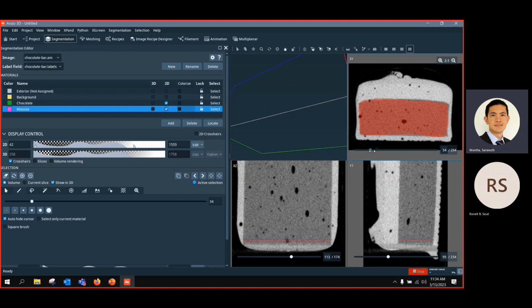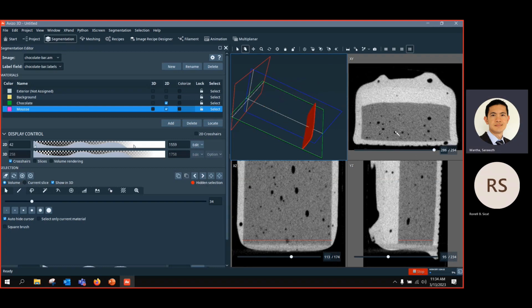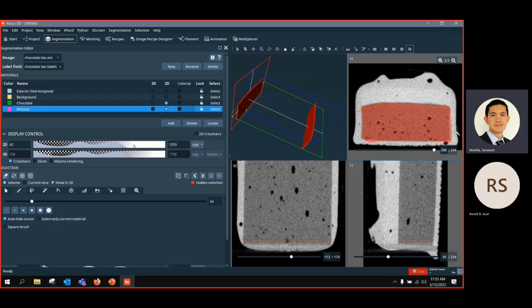Yeah, and then you can look here on the 3D. I start to draw the first slide, and then I go to the last slide, only to here. Over here, you can see the last slide, and again do the same drawing. This and F to fill and Control to erase, something like this.